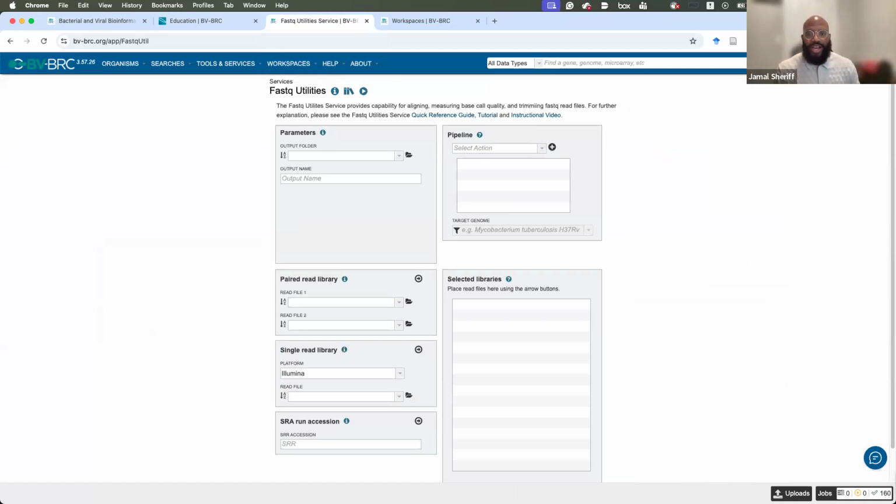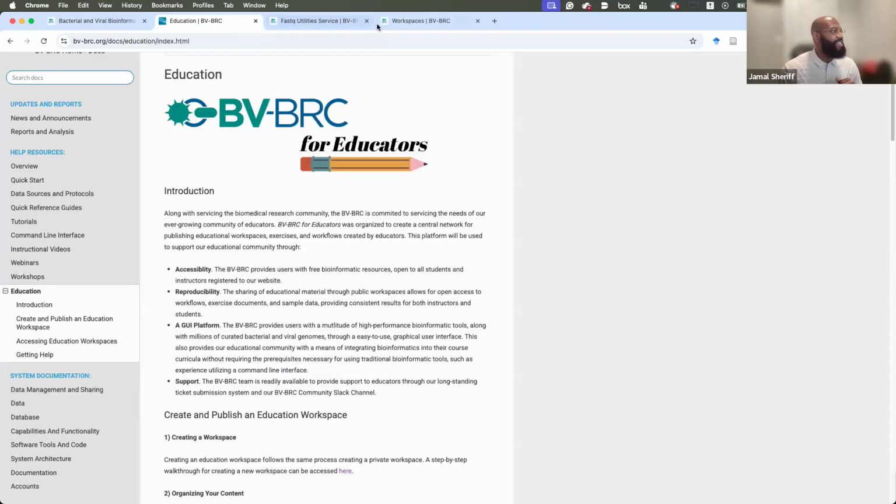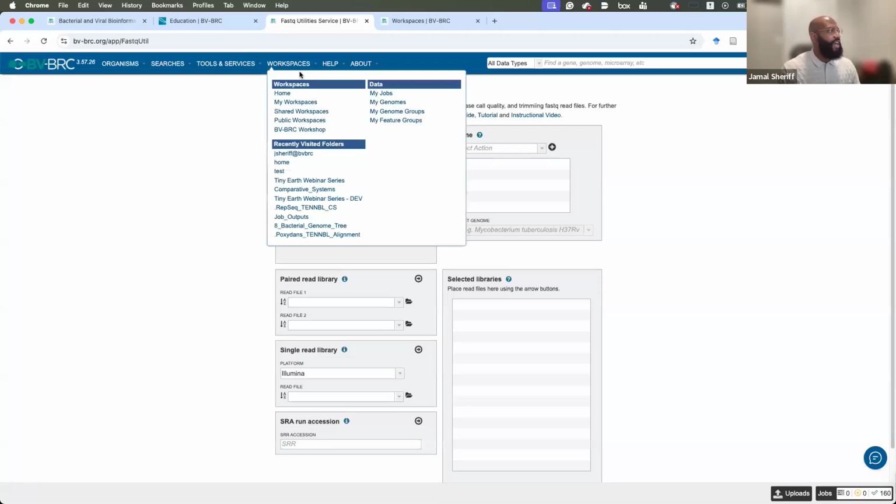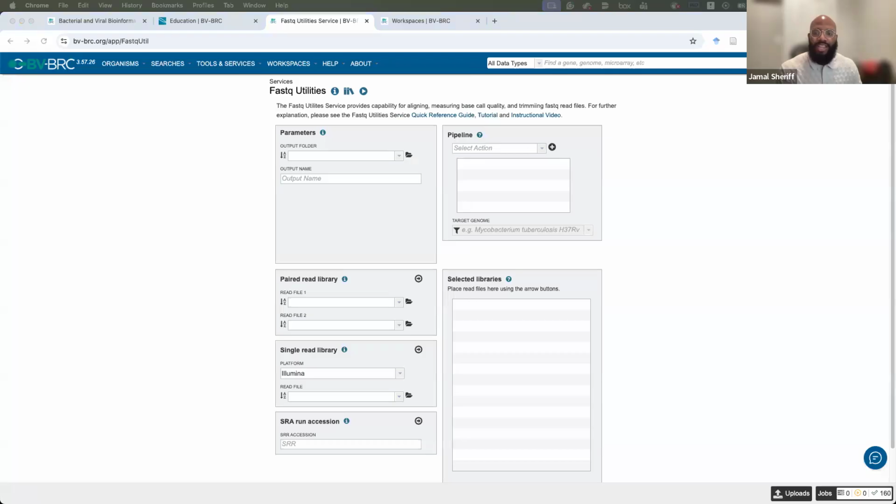All right. So at this point in time, you have registered for the BV-BRC. Now you want to have access to our exercise material we need for today. You can do that within your handout. We're looking on page 8. We see getting started, registering for the BV-BRC, accessing the exercise material. After you've registered and signed into your account, number 2, there's a hyperlink that says you can access the exercise material here.